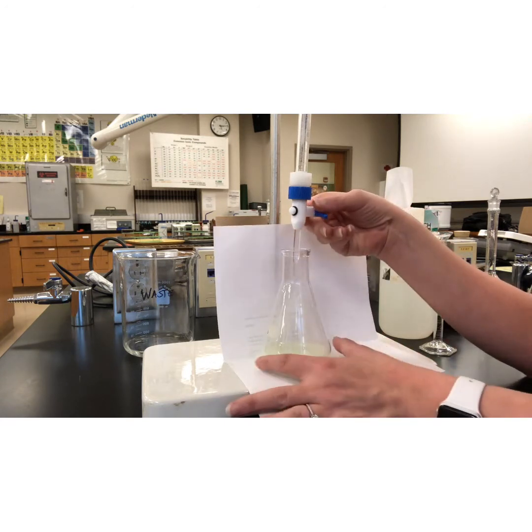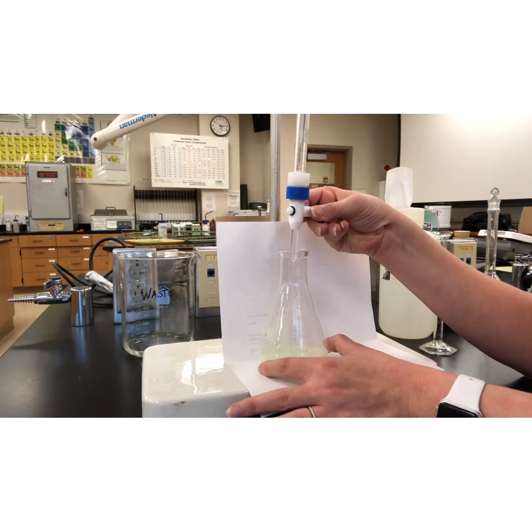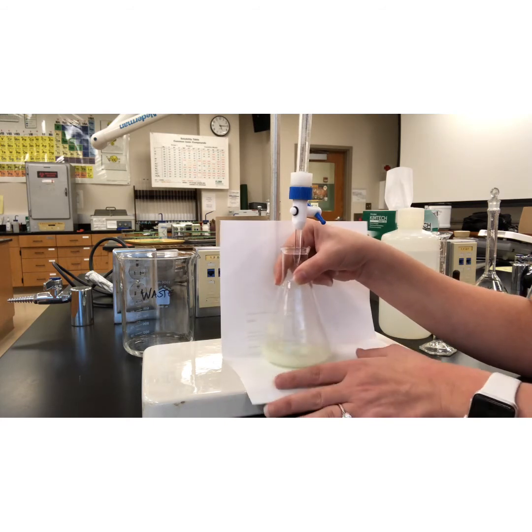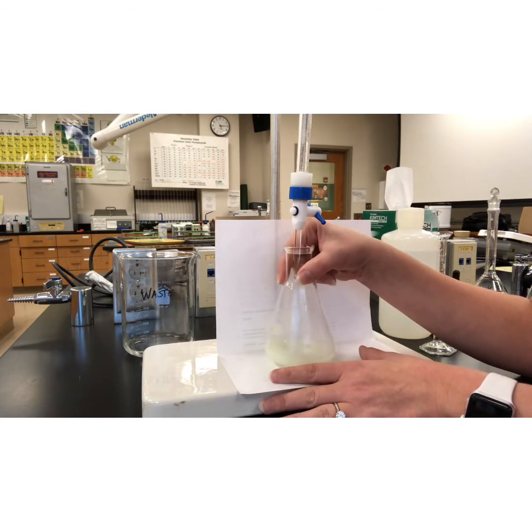Add just a little bit more because it is coming out quick. So I'm just going to slightly turn the stopcock to add drops. And I'm going to swirl. Swirl, swirl, swirl, swirl. The entire solution changes color.